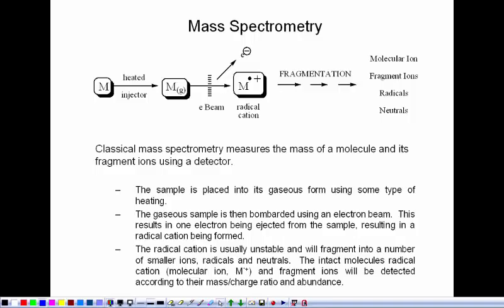So we're going to start with spectroscopy again today, spectrometry. The topic we're going to talk about, we're going to take this in 2 weeks, is mass spectrometry. This week I'm going to talk about the basics of it, and then next week we'll talk more about some fragmentation patterns and how those occur. And next week there'll be a small homework assignment for the spectrometry.